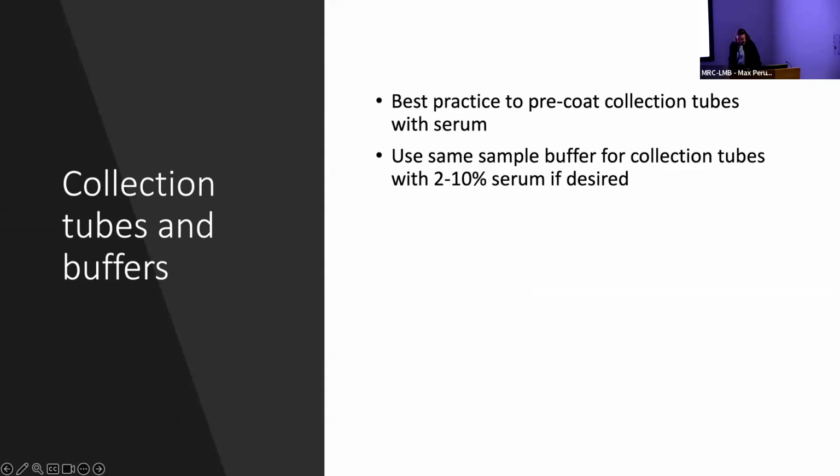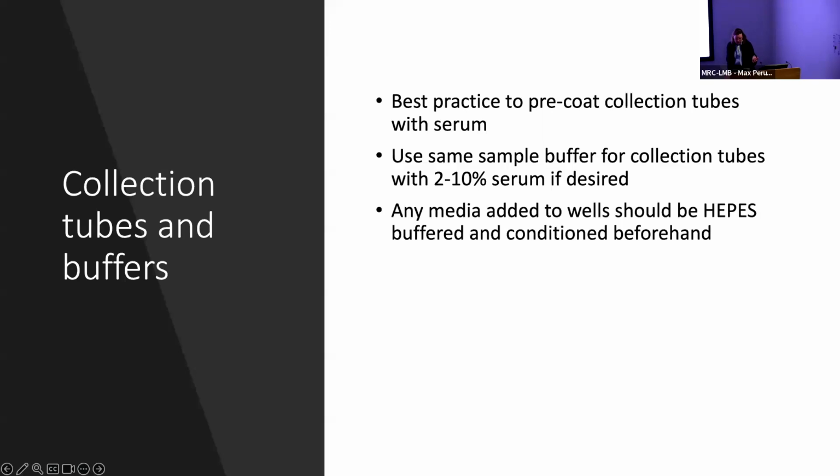serum environment. The other reason why we always recommend the same sample buffer is that if you have two different sample buffers, if the collection buffer is a different type of buffer from what your cells are in, there would potentially be a mismatch in pH. So for example, with any kind of bicarbonate media, if you're using a bicarbonate media in the collection tubes, as the sort buffer is added, it's going to increase your pH and it's going to cause undesirable salts to form and, of course, result in some reduced viability.